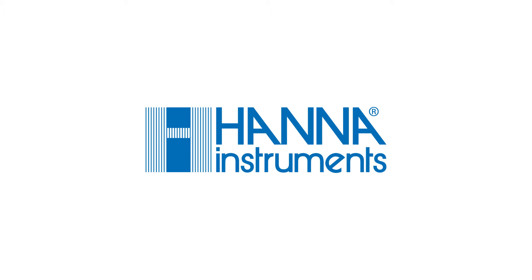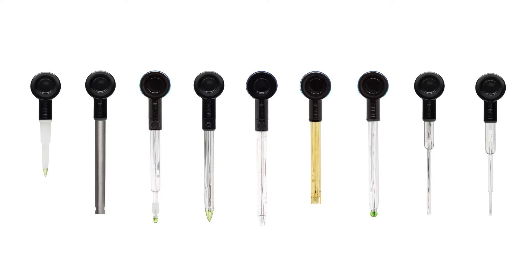Hey guys, welcome to the HANA Lab. Today we're going to go over the Halo wireless pH meter. If you have a smartphone or tablet, Halo brings convenience and portability to a whole new level. It's the world's first wireless pH meter with built-in Bluetooth, paired with a HANA Lab app. Designed for industry professionals and hobbyists, the Halo wireless pH meter line meets your needs.